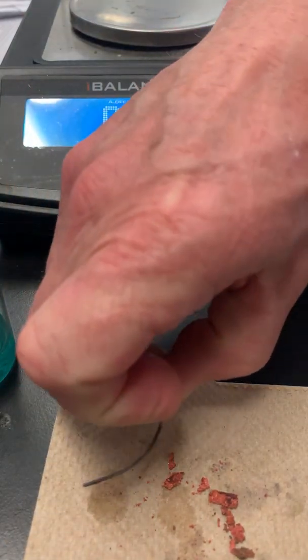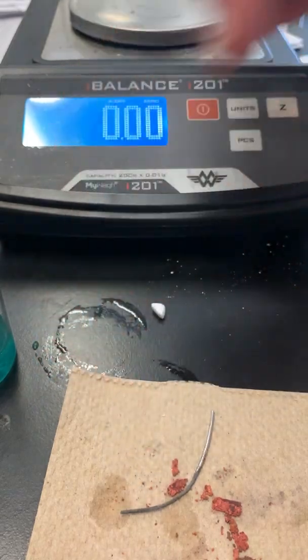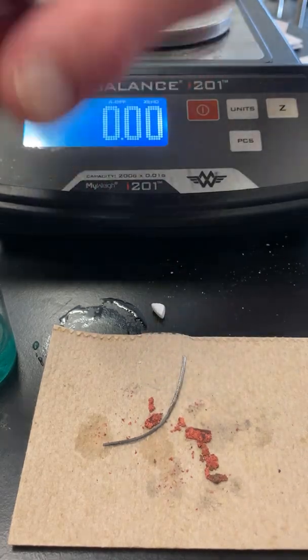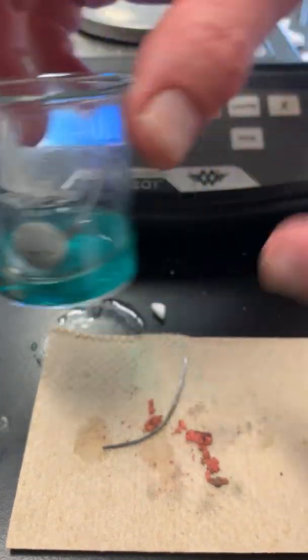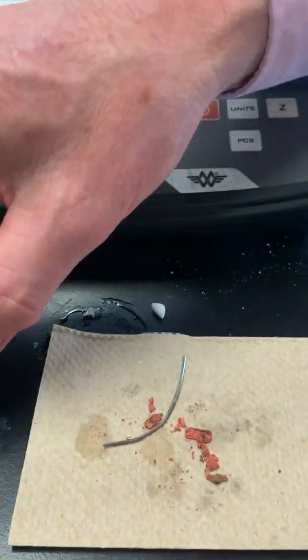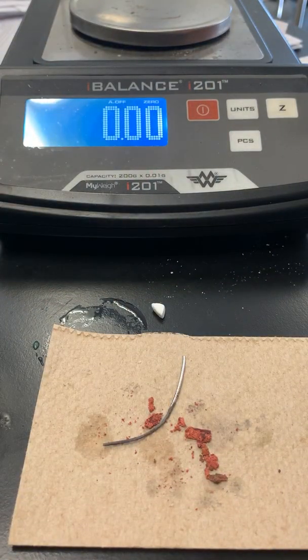I know the mass of the aluminum, from which the reaction took place. By the way, the aluminum is inside the solution now, as an ion, not as a metal. And that's it. You have a bunch of mole calculations to do, and I can't think of anything else. The reaction continues to take place. Please use descriptive answers and fill in the blanks, do the calculations and turn that in. Thank you.